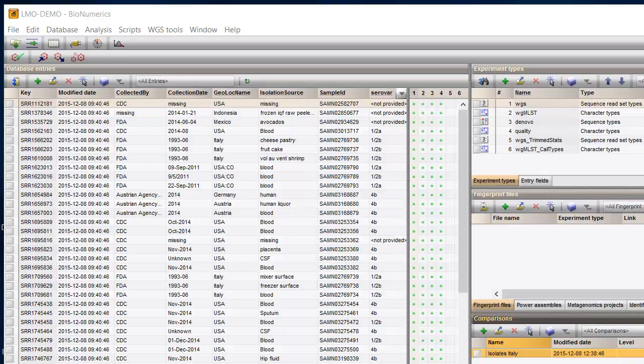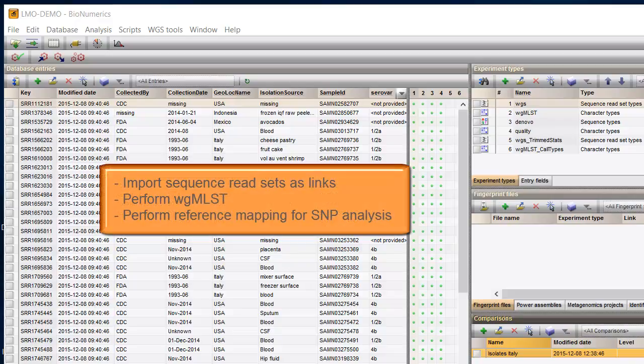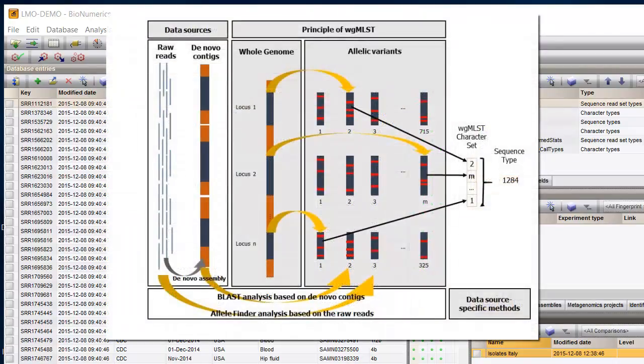With the Whole Genome Sequence Tool plugin from Bionumerics, you add a number of extra features, like the import of Sequence Read Set as links. You'll be able to perform MLST on a genome-wide scale.